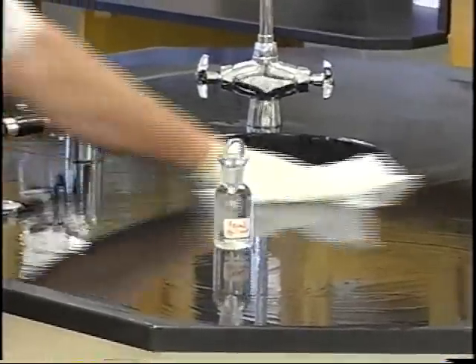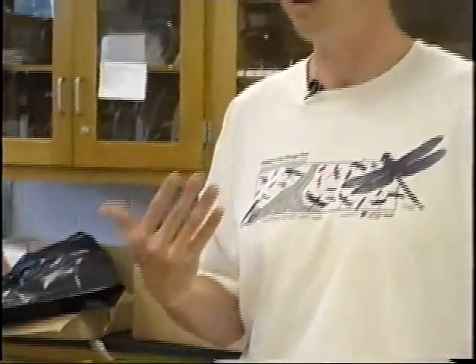What we're going to do in a minute, once this is sterilized, is show you how to work as a team. There's probably going to be 4 of you. There's only 2 of us, but we'll show you how to work in a team of 4 so that you're getting this test done efficiently and effectively by having different jobs with different people in your group. So we'll show you that next.